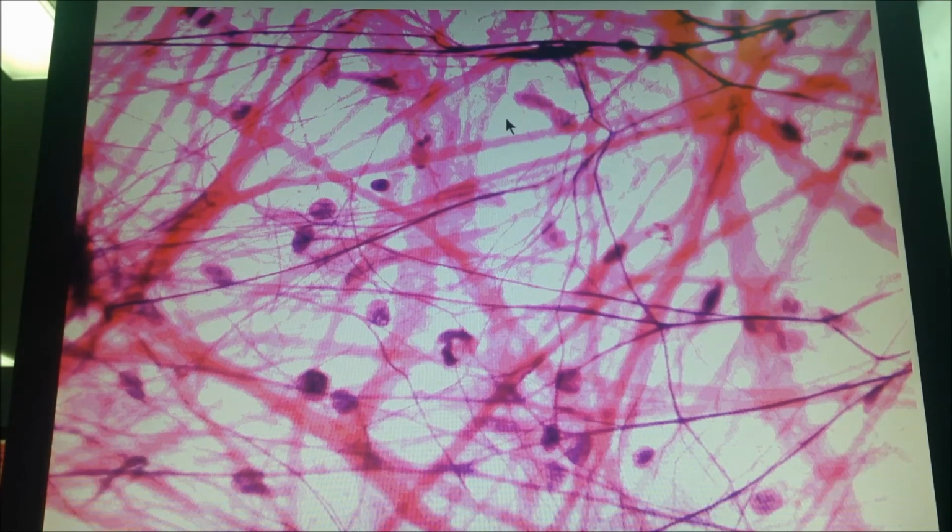نيجي هلا هون للwhite tissue spaces اللي ضلت موجودة. شو هاي الwhite tissue spaces؟ شوف in your body there is no space. There's nothing empty in our bodies. This is yes, excellent. These spaces are filled with the ground substance. But during sectioning, the ground substance will be dissolved and it will appear as a white space instead.